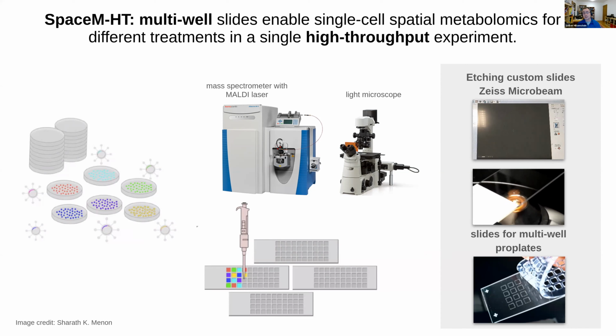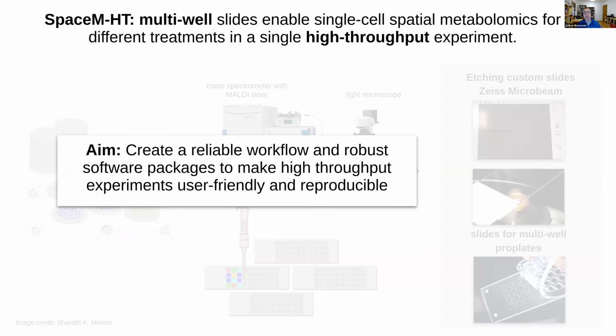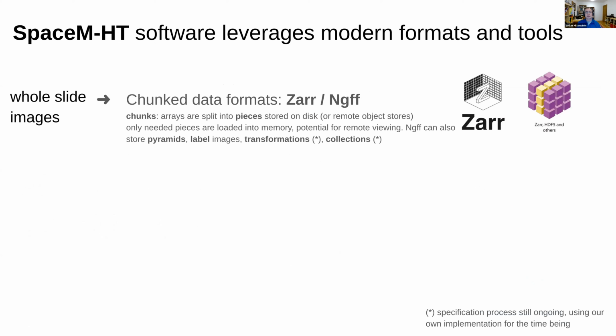Okay, so we want to move to high throughput, and we want to make this all robust software, not just a bunch of Jupyter notebooks and scripts that are error prone to reproduce. So we want to make it so that all of our lab members and then beyond can work with this software. To do this, both Andreas and I like to work in the Python ecosystem, and we are trying to use modern tools.